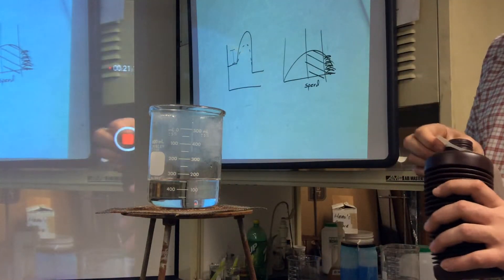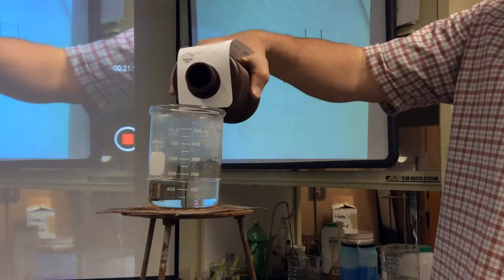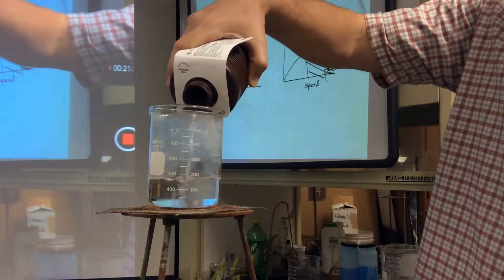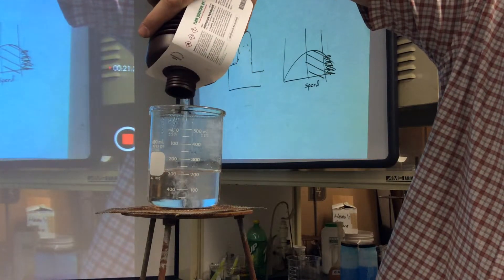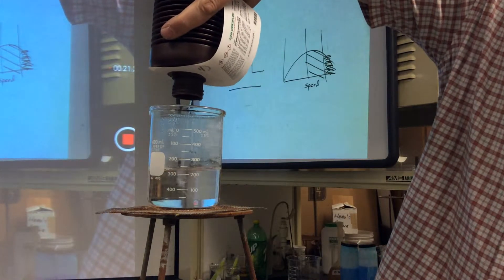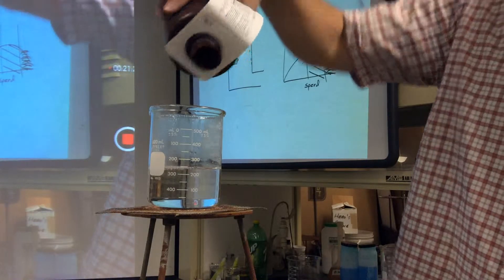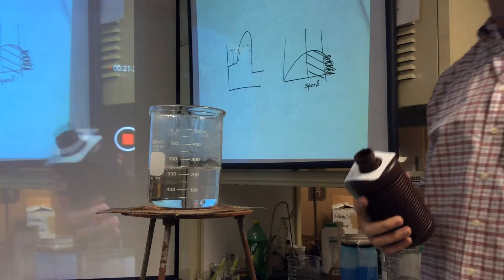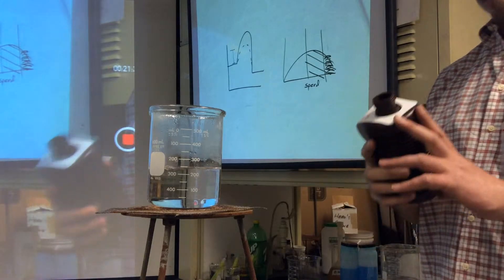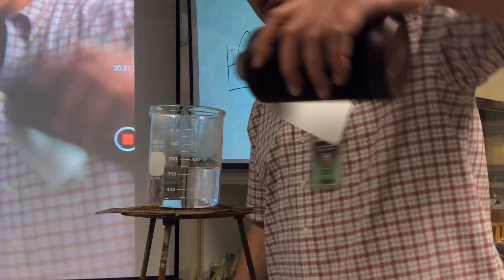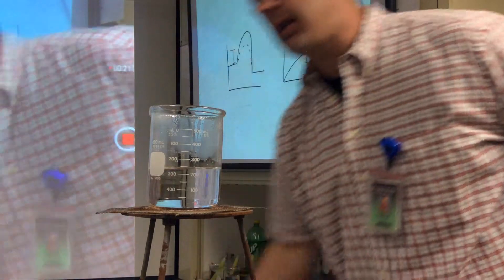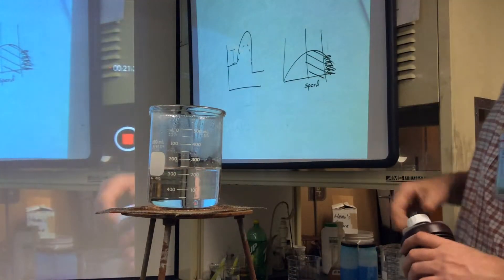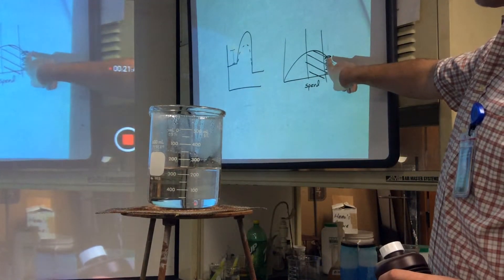All right, now right now the hydrogen peroxide should react with the salt. In fact, it is reacting, but it's reacting too slow. It's not doing anything that I like it to do, it's not very visual. So what I'm going to do is add a catalyst.